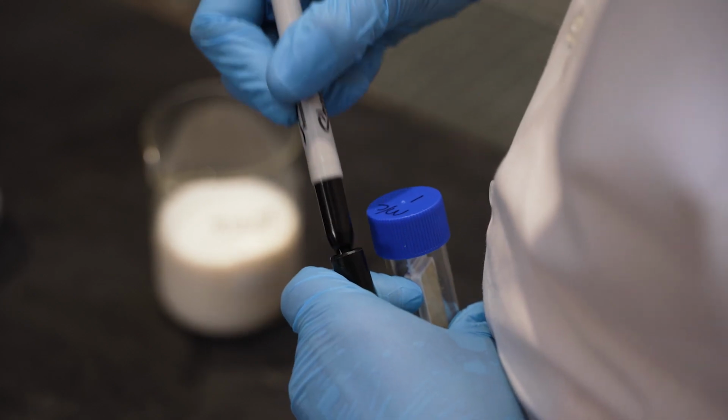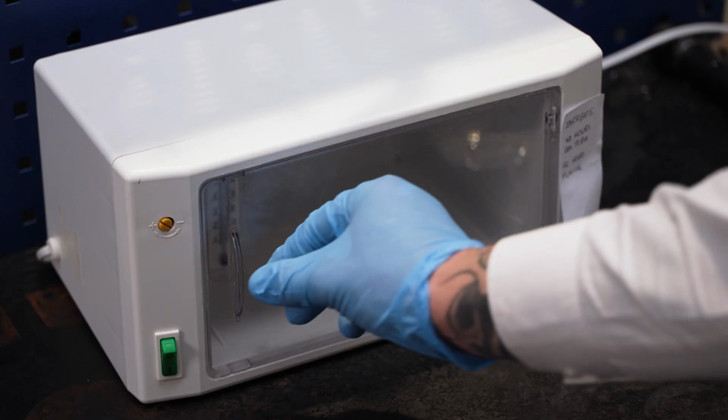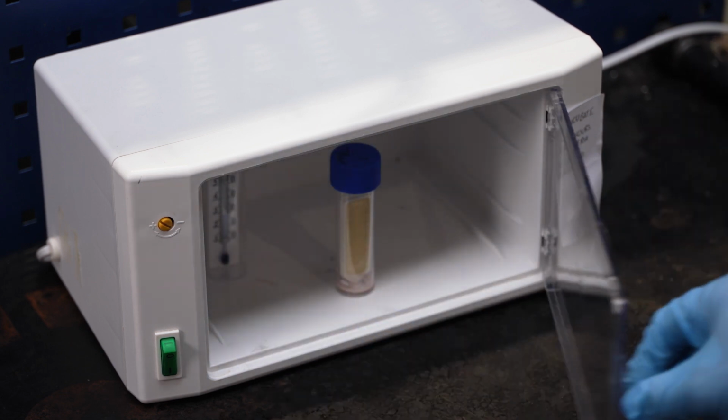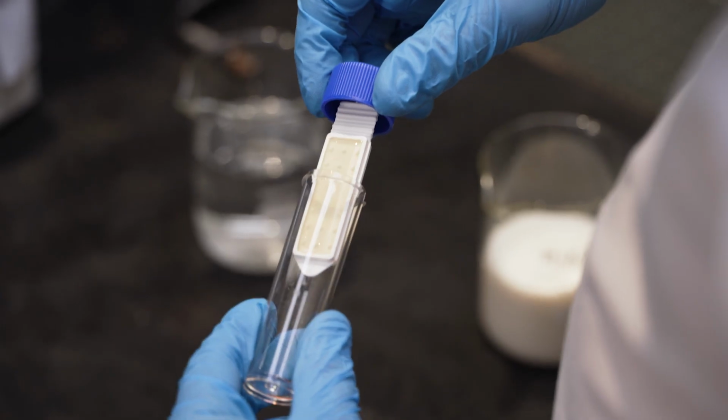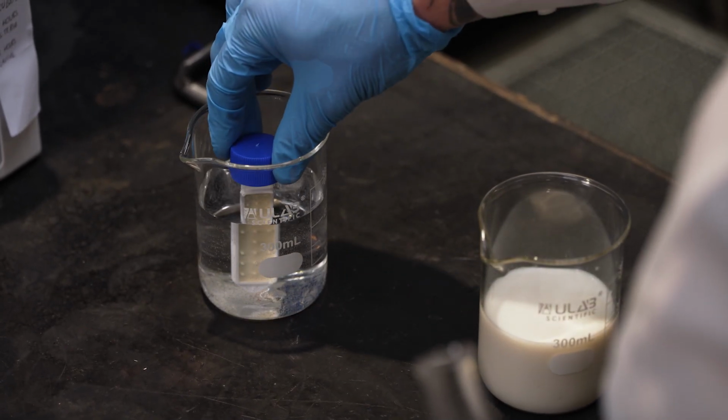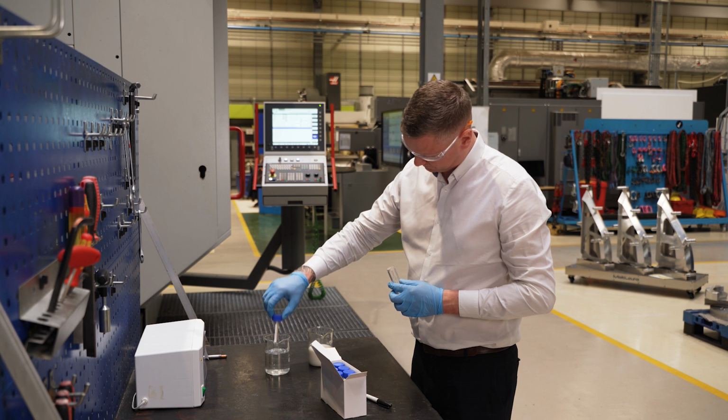Place the dipslide into the incubator. Leave for 24 to 48 hours to check for signs of bacterial growth. The manufacturer's instructions should provide details on the correct temperature and incubation time. Ensure that a dipslide is also used on your water supply as a control test.